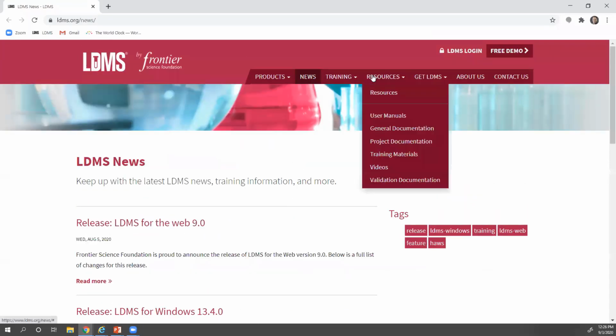And while we're here, always a reminder, everything we have created for our laboratories is available on our resources page. We have our user manuals that has been updated for 9.0. It's always updated when we do a new release. Training materials, those have been updated as well. Videos, I'm in the process of refreshing some of our videos. So you'll see some of those new ones come out on this videos page, also hosted on our YouTube channel. So always remember your resources are available here.